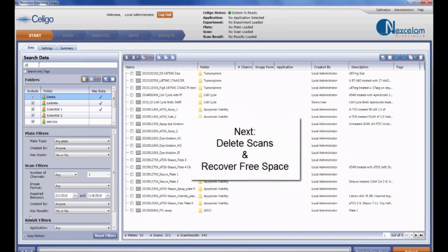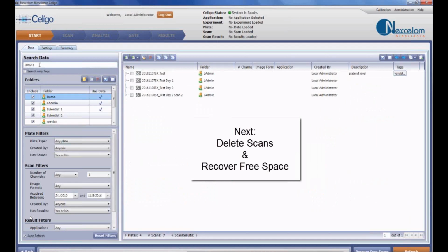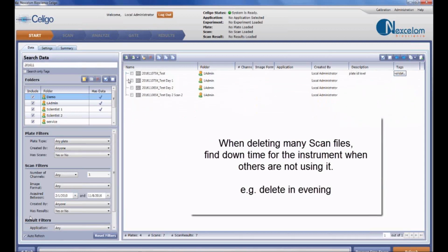You know that everything is in an unchecked state except for the folders on the left-hand column. Okay, so after you've done a lot of deleting, for instance, this is our test. We want to actually delete the ones that we don't want anymore since we've merged them. And this is where I would recommend creating a user folder, delete or trash or recycle bin, and move these scans into that folder.